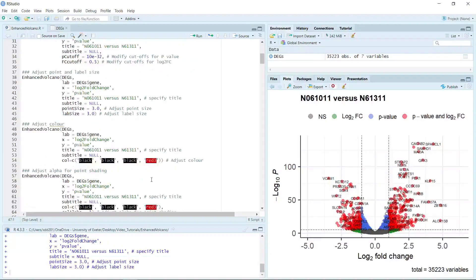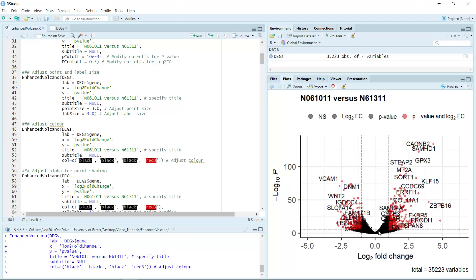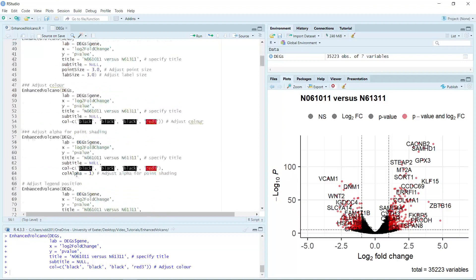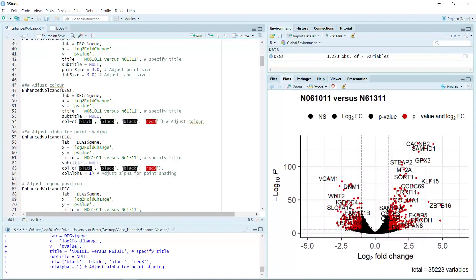We can also change the colors. For example, we can change the first three colors to black and just keep genes meeting both the p-value and log2 fold change cutoffs as red, using the col argument. After running, you can see the color changes — not significant genes, or genes meeting only one criterion, are now in black, while genes in the cutoff region are in red. We can also adjust the alpha for point shading. If we set colAlpha to 1, the red points become a darker red color.